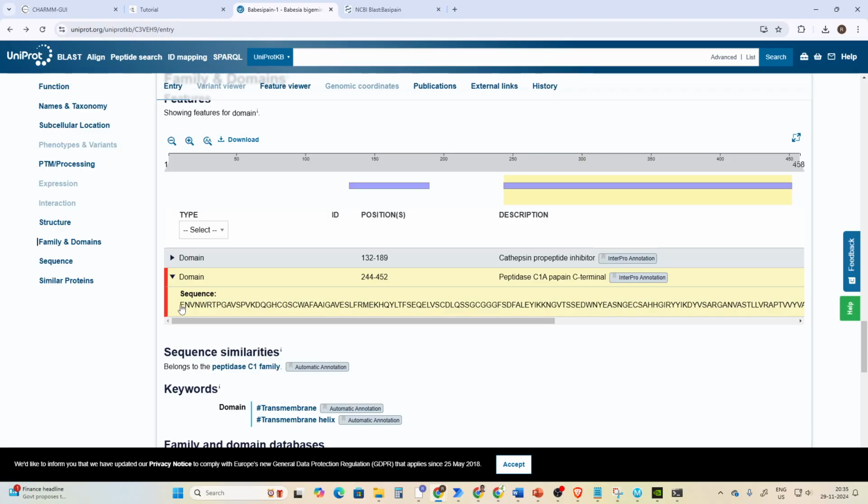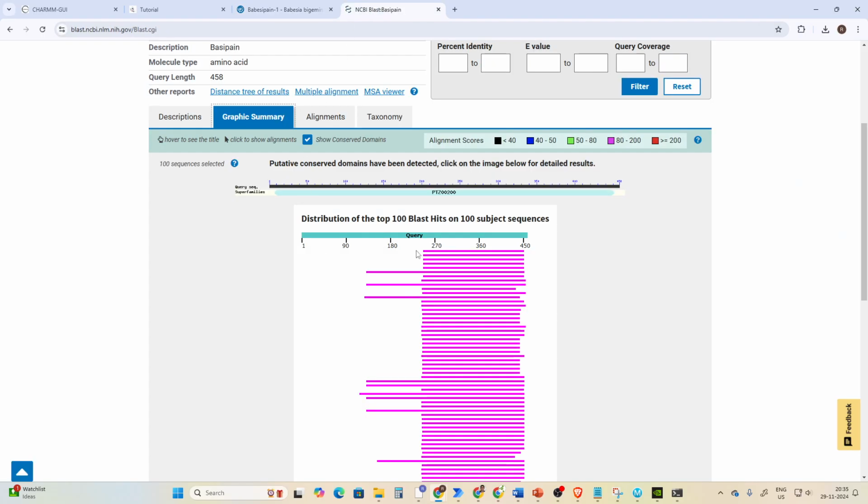the sequences, I mean before this particular domain, you may be getting your sequence coverage high as well as sequence identity. Okay, I mean sequence identity will remain the same, but the sequence coverage will become high.